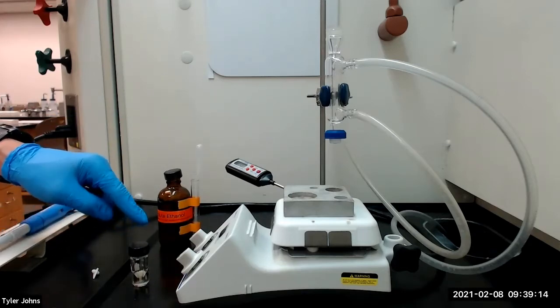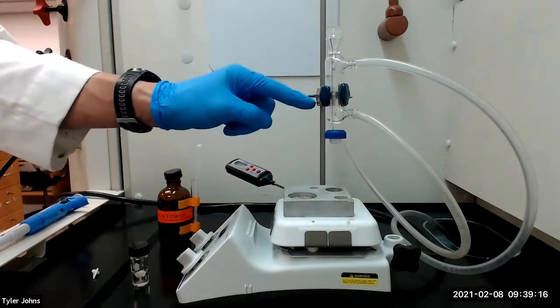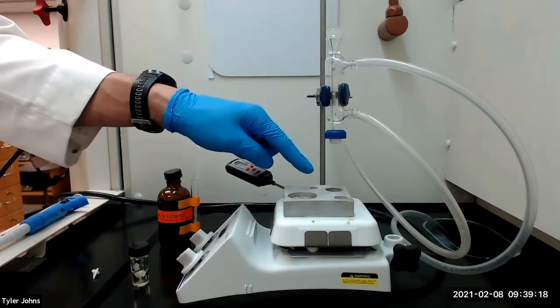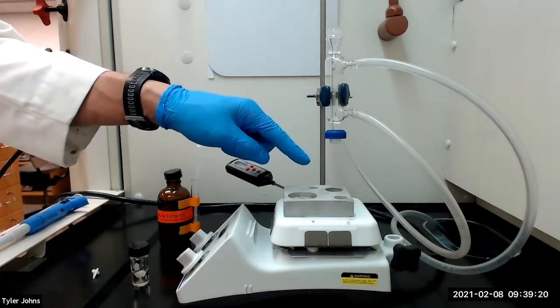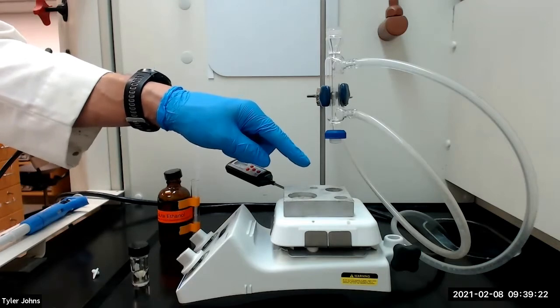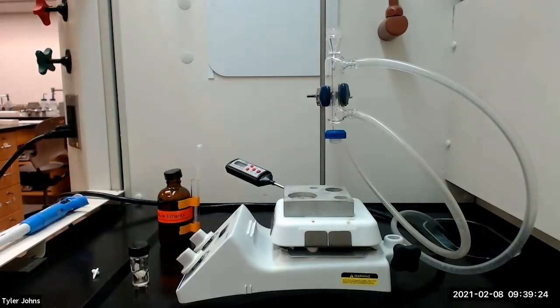We will then attach the conical vial to a water-cooled condenser and heat the vial on an aluminum block at approximately 80 degrees Celsius with stirring until the solids have dissolved.